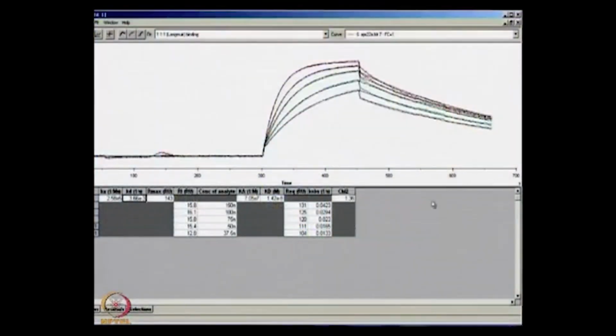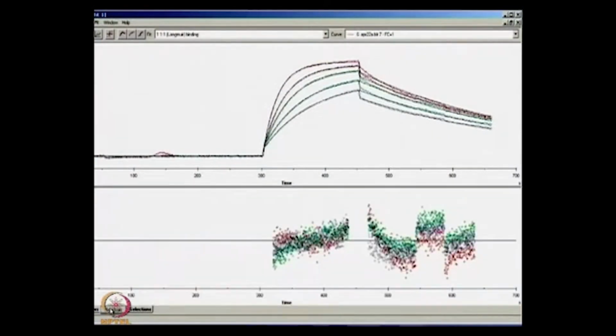And you can also quickly check how good your results are by checking the residuals, and you can see the residuals here. The chi-square values are really between -5 to +5%. So extremely good, very tight fitting of reactions and a very fast analysis that gives you K on and K off. I think it's extremely fast and very good, very easy to use interactions analysis software. So yeah, it was very useful and informative to see how easy it is to perform the kinetic analysis.